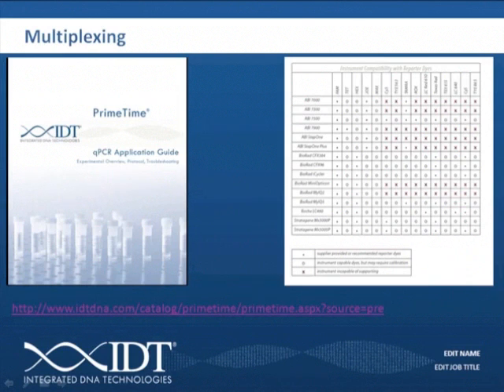Okay, so don't just copy the paper. Just keep in mind the TM. If the sequence of their probe is around 15 mers, it's likely an MGB probe, because that TM is likely going to be much lower than 65. And so that's a way to know. The length, if it's less than 15, definitely, 15 to 18, maybe. So there are some key things there you can look at to know whether it's MGB.